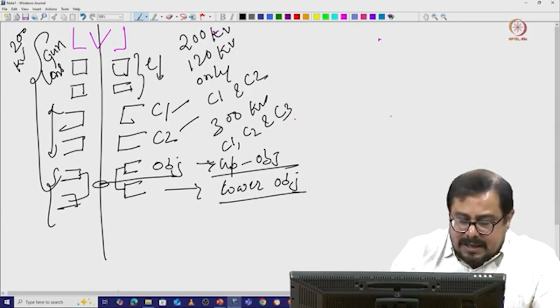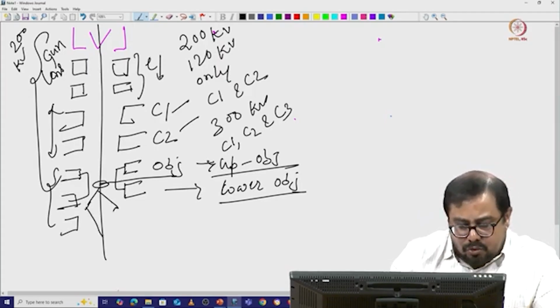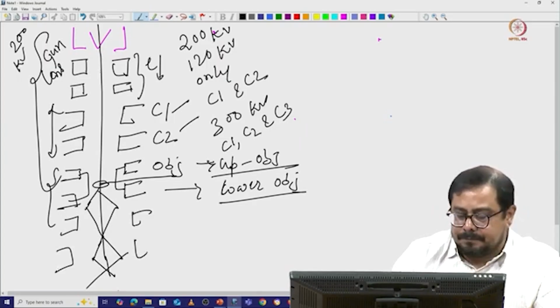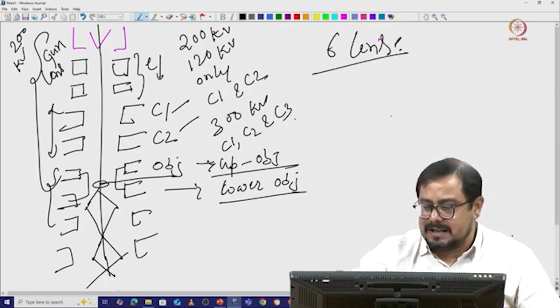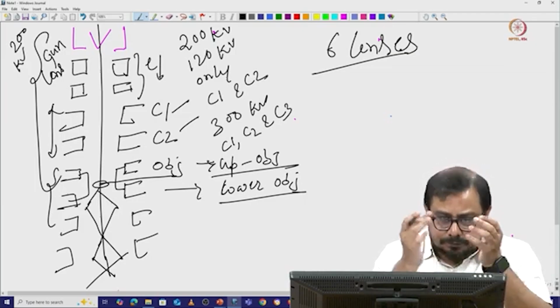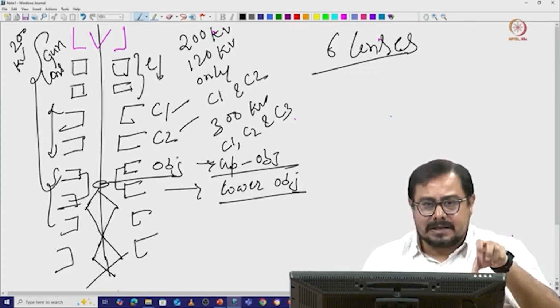When it goes through the sample, after that the electron beam goes through multiple other lens systems and gives us an image at the image plane. So there are a total of 6 lenses we are using to get an image. It is not like that for a light microscope, where whenever required we change the lens completely.